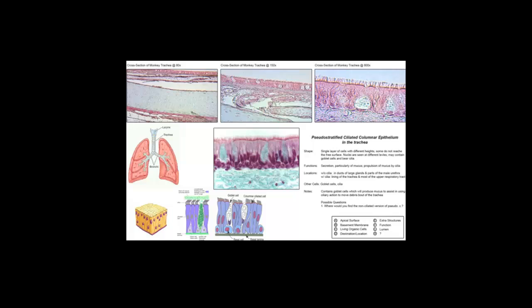This is our perichondrium. Since cartilage, hyaline cartilage, is an avascular tissue, and the chondrocytes residing in the lacunae throughout are going to need a supply of nutrients and blood gases and elimination of CO2, we would surround this hyaline cartilage with a band of dense irregular connective tissue to provide what it needs, and that's referred to here as the perichondrium of that cartilage.